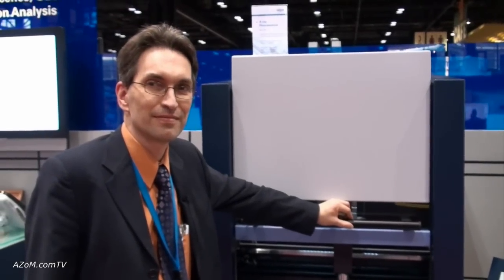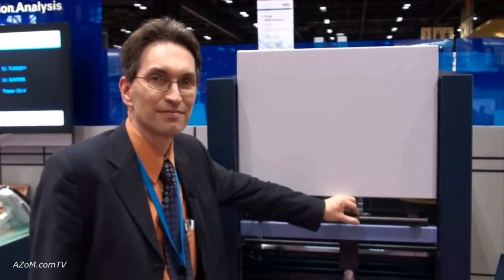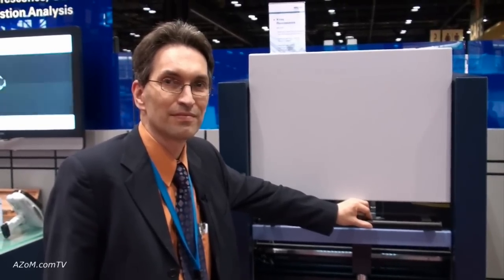This is Cameron Chai from azom.com and I'm speaking to Alexander Seyfarth from Bruker, and he's going to tell us about their XRF analyzers specifically designed for working in the concrete industry or cement industry.